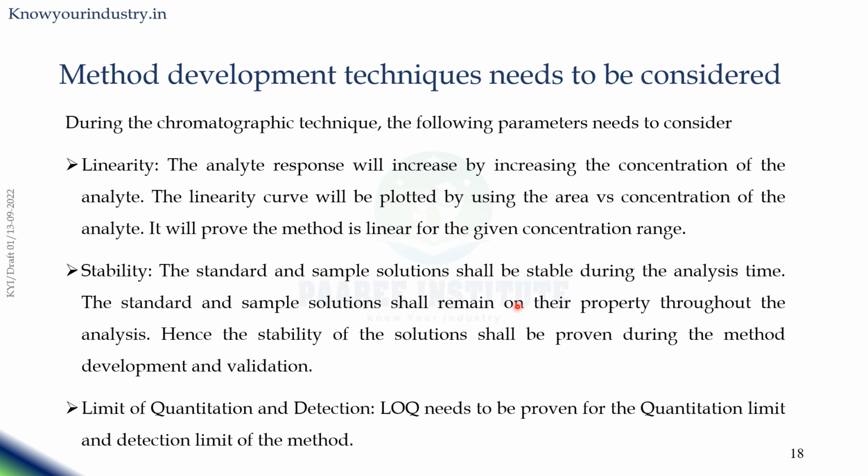Then finally you have the limit of quantification and detection, where the method sensitivity is proven. The limit of quantification is the minimum concentration you are able to establish and measure accurately in a particular method.